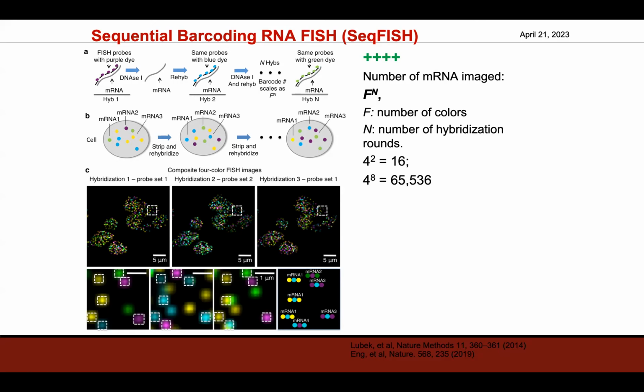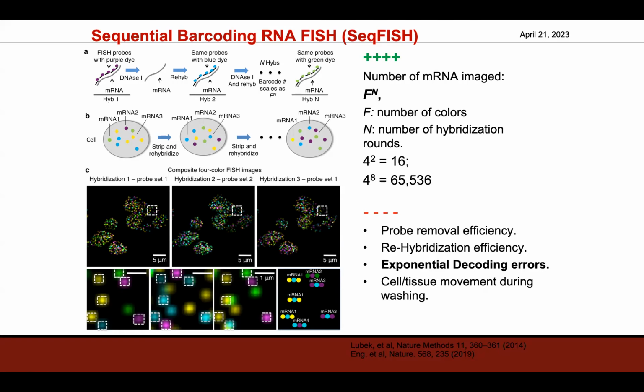So it's almost a whole genome transcriptomic imaging in a single cell. But this is very powerful, but there are some issues about the technology. For example, the efficiency of probe removal really depends on sample to sample, and also the efficiency of rehybridization is not very constant.